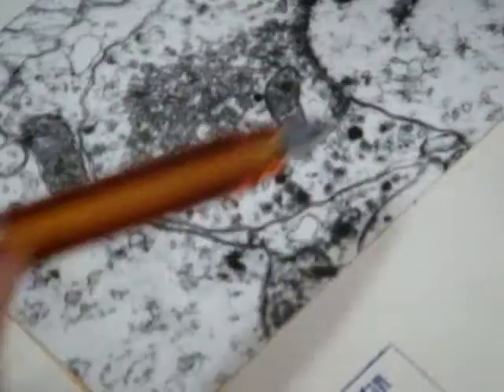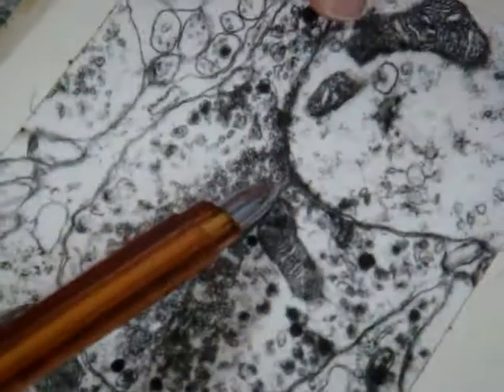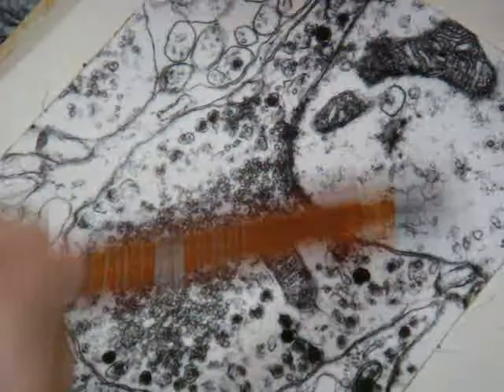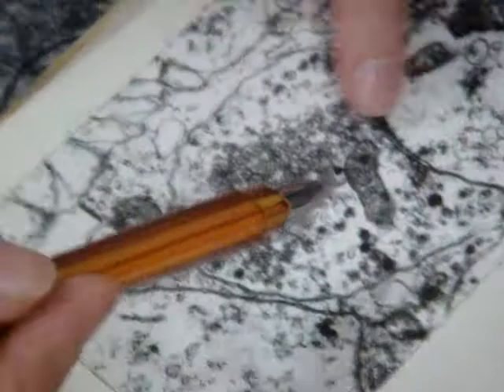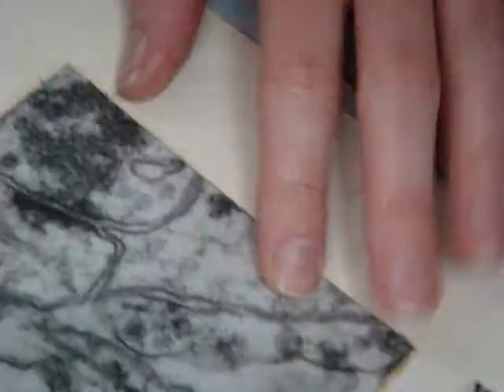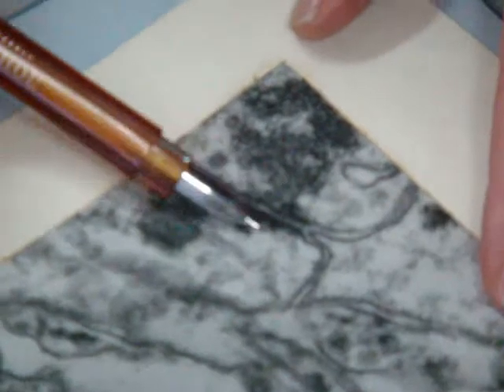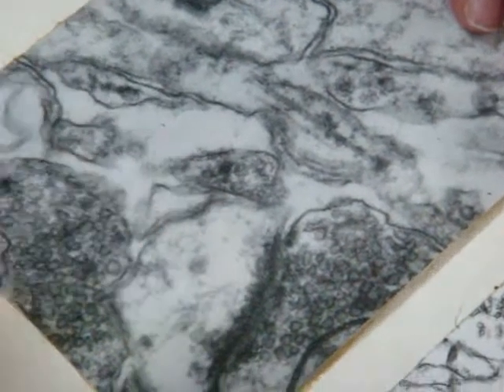Again, now we can see a synapse. Look please, what is this junction? This is the presynaptic membrane, why? Because here we can see mediator vesicles. This is the postsynaptic membrane because vesicles are absent here. Mitochondria, so this is again neuropil, and we can see synapse structure. This is again synapse structure. Which is the presynaptic membrane, left or right? Left, because we can see the vesicles. This is also a nervous process with mediator. This is one more synapse.